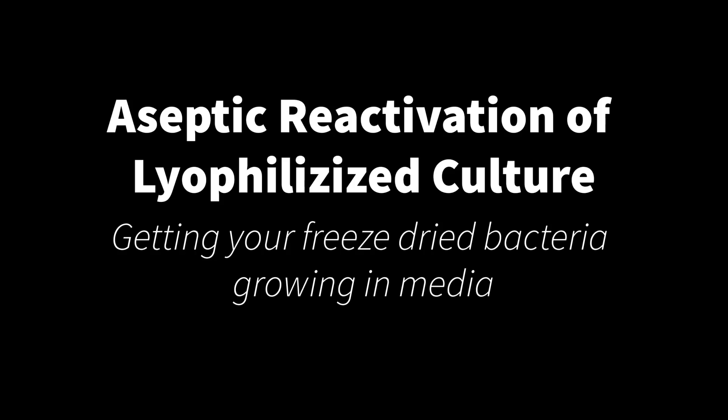This video shows you how to reactivate a lyophilized culture. These are the bacteria that you get from your Carolina kit that are freeze-dried and they need to be activated and grown in media before you can use them in any experiments.